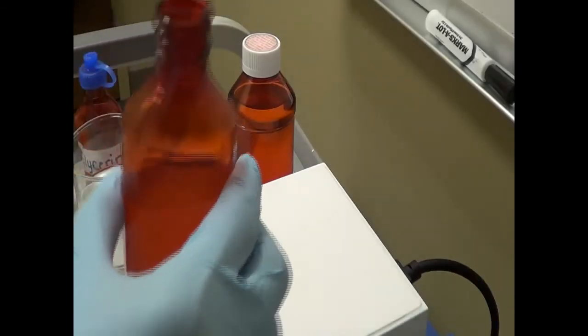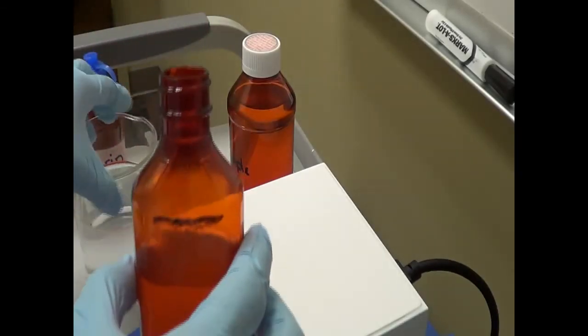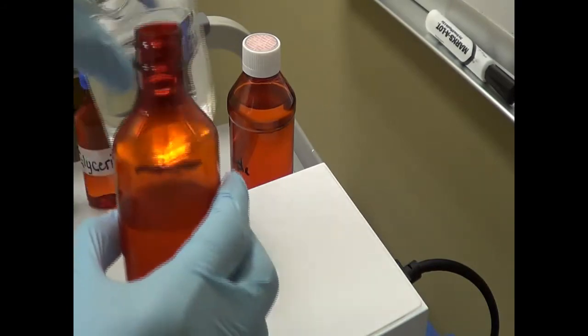I am going to transfer carefully this syrup to the pre-calibrated bottle. Here is the pre-calibrated bottle — I am going to simply transfer this solution back to the bottle. As you are aware, there is still some leftover drug and syrup, so I am going to add water to make sure that 100% of the drug and everything is transferred from the beaker to the bottle.